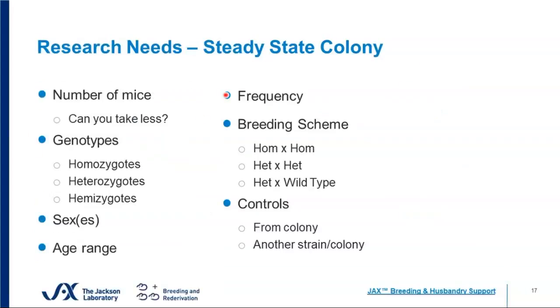If you need a cohort of mice at 3 months of age, a cohort at 6 months of age, and one at 12 months of age, et cetera, are they all the same size? That's the first thing. If they're all the same size, you're looking at basically producing 20 mice, but you need them every 3 months, right? So that's every 12 weeks, and you just walk through it.